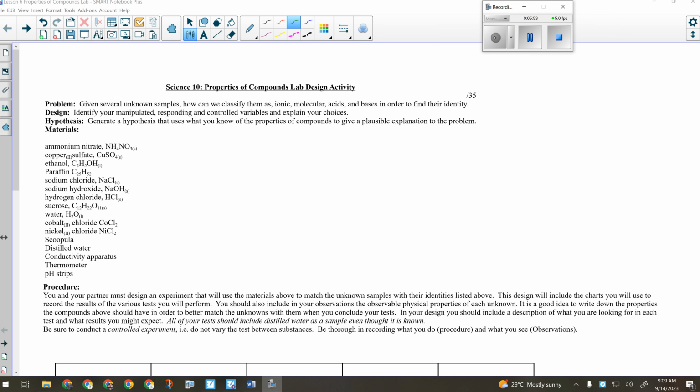Okay, there are 11 materials. Each time I run the battery of tests, it's on a different material or a new material. What I'm watching for each time I run that battery of tests is basically the results of the tests. Now the tests are testing for, or supposed to reveal to me, the physical properties of that material. So I have a new substance. I run this set of tests, and I get physical properties.